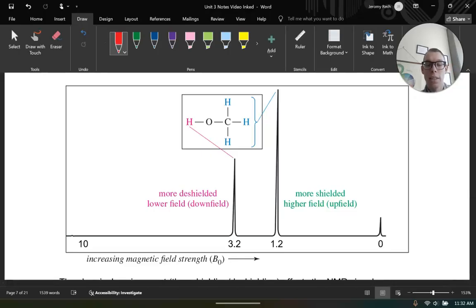On our x-axis, we are going to be plotting something known as chemical shift. I'll define that in a minute. It has a unit of parts per million, relative to the frequency difference between the effective and the actual. This is plotted much like IR, in a backwards realm. So 0 is going to be far to the right, and the numbers get higher as you go to the left. Typical range for proton NMR is between 0 and 14.